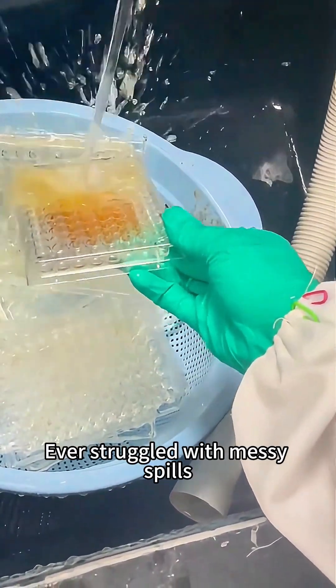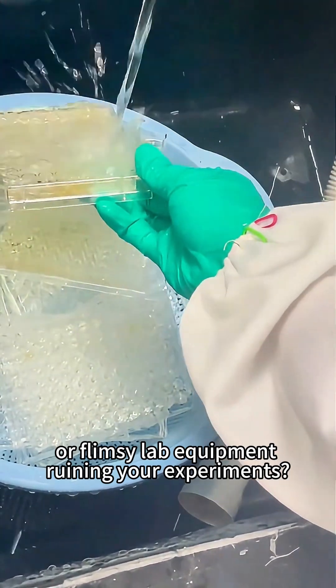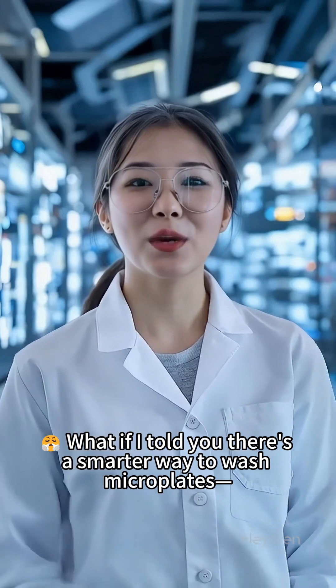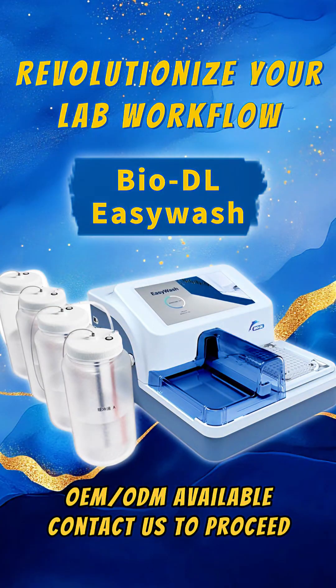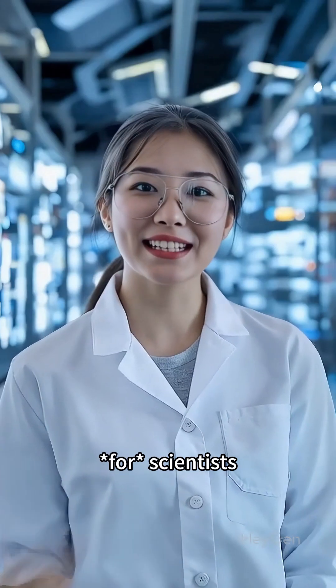Ever struggled with messy spills, inconsistent results, or flimsy lab equipment ruining your experiments? What if I told you there's a smarter way to wash microplates without the drama? Meet the BioDL EasyWash, a game changer designed by scientists for scientists.